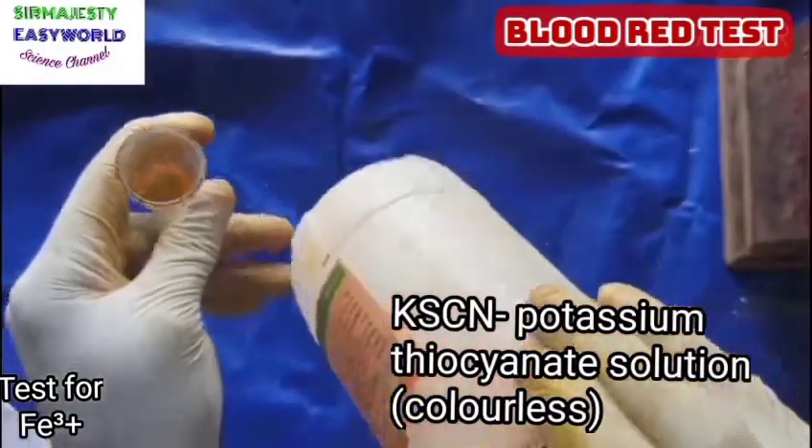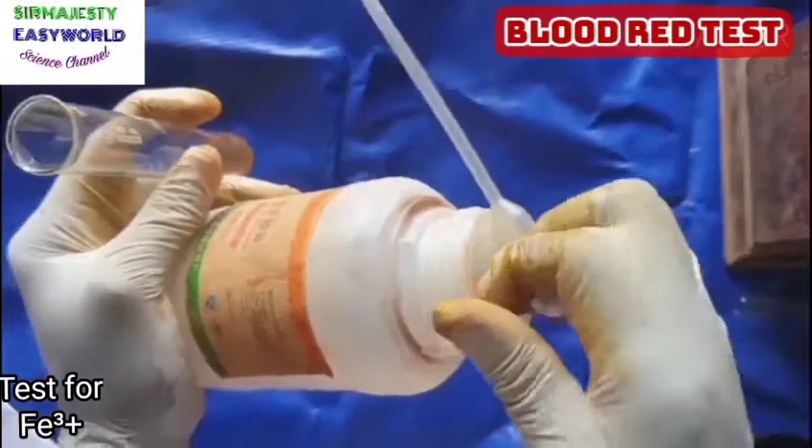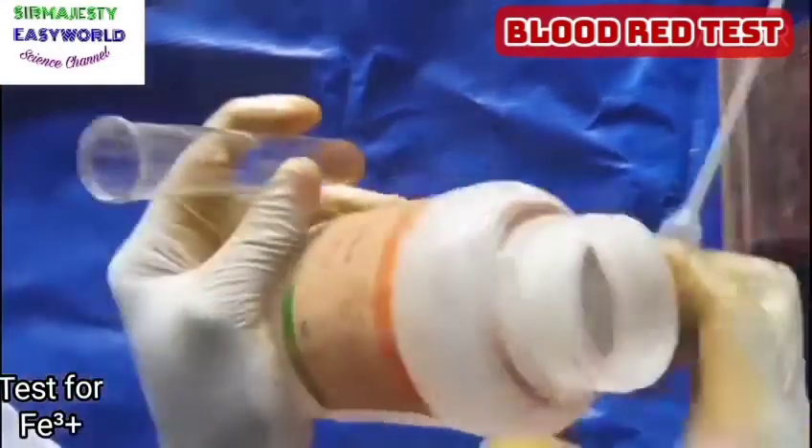Here is potassium thiocyanate — it's colorless, but on adding it to any compound that contains Fe3+ ion, it forms a blood red coloration, and hence it is called the blood red test.